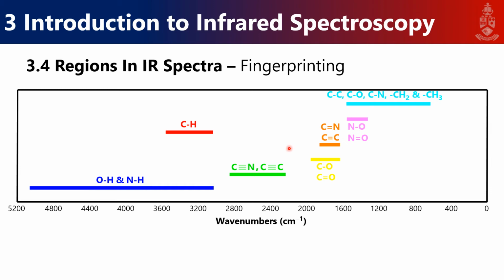It's not, like I said, the definitive holy grail of characterization techniques, but it is a way of getting an idea, or at least what you can use. And like I said, in the fingerprint region, each of them should have their own unique bunch of stretches that we can use to say each of them are different complexes.